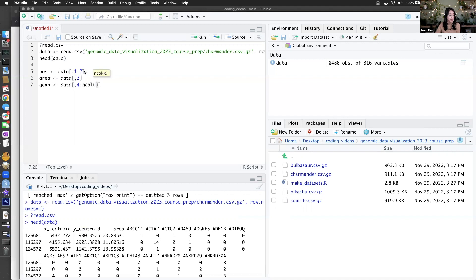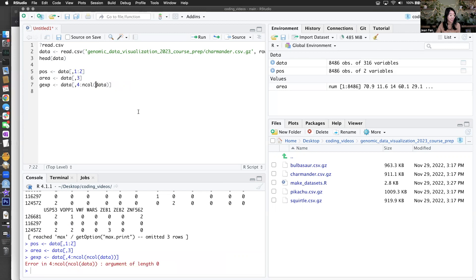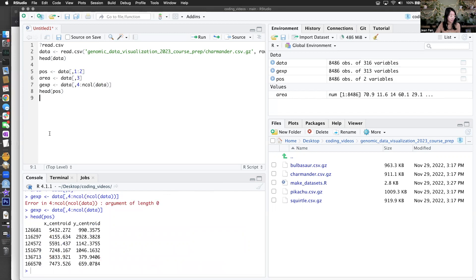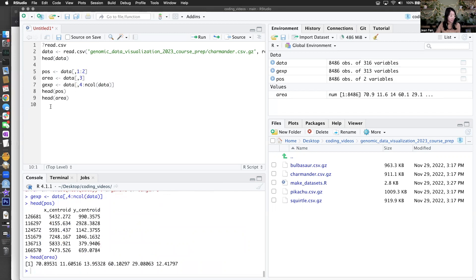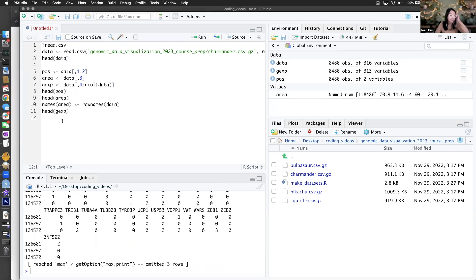The first two columns are our position data, then area of the cells, and then genes, which will go from column four to whatever number of columns that we have. Let me double check — we have our area, and I want to make sure our area keeps the names, and gene expression. Okay, that looks good. So we've read in our data.